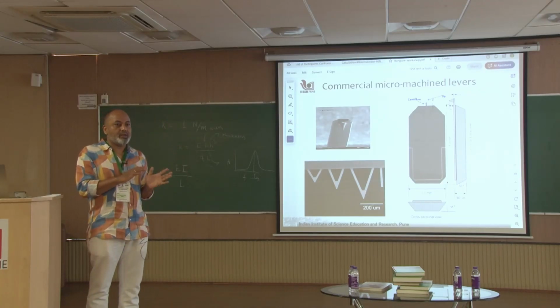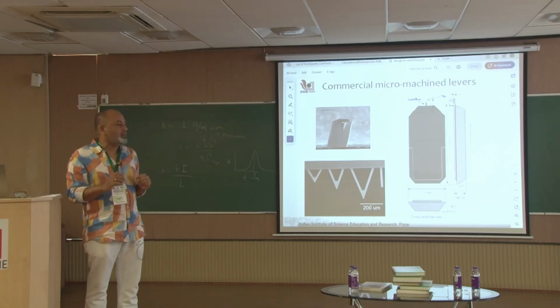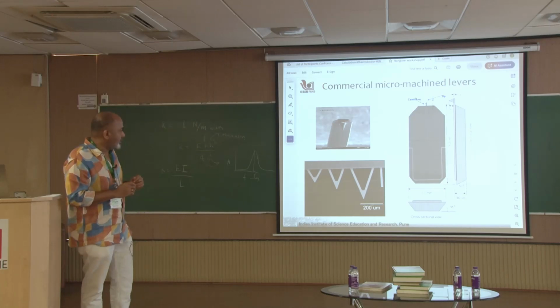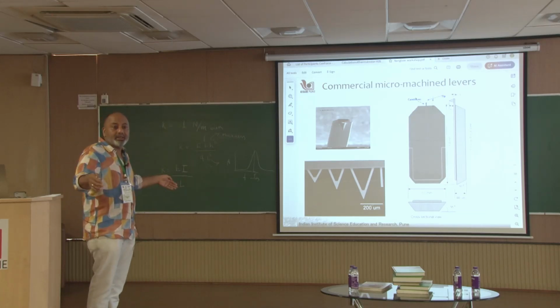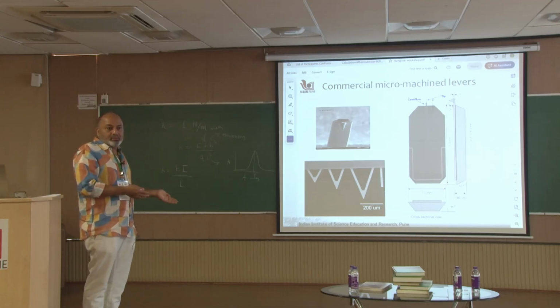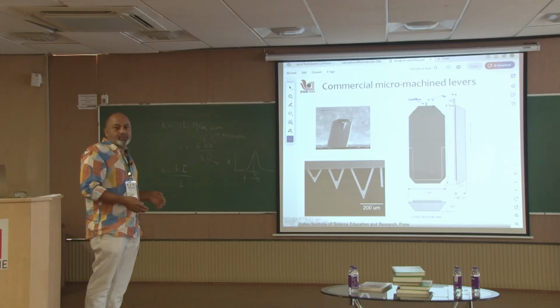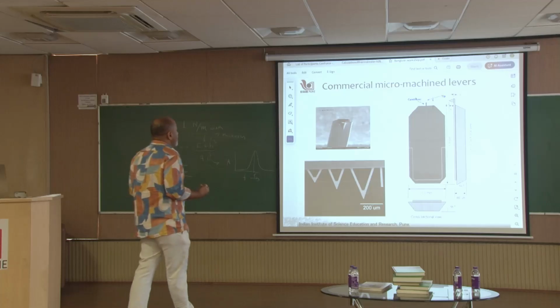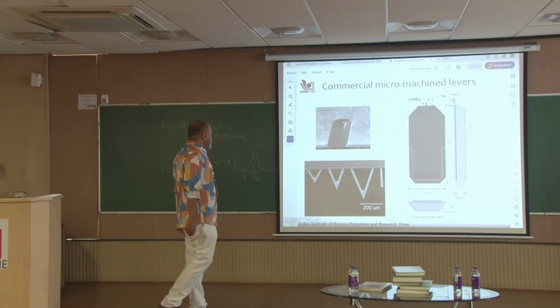And that's one advantage of AFM over other tools, that you can vary the cantilever stiffness by changing the tip, and there's a big range of stiffness one can choose from. This is an advantage because of the kind of interaction you are probing or measuring. If it's a strong force, a stiff cantilever is good. If it's not so strong a force, you have to use weak cantilevers. So this kind of maneuvering, or choice, is possible.